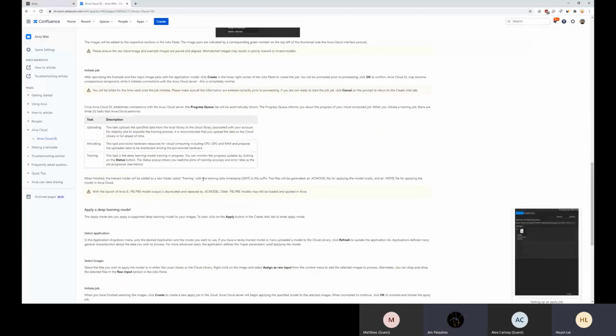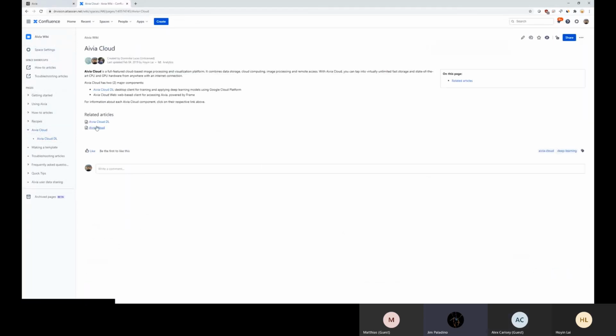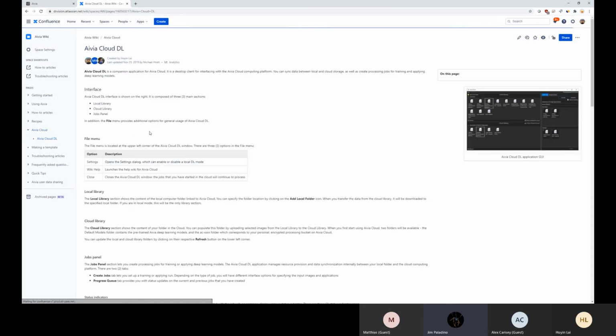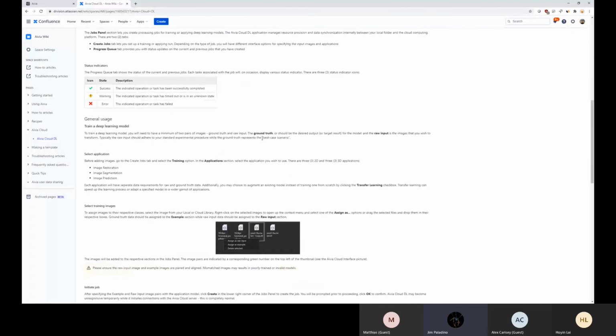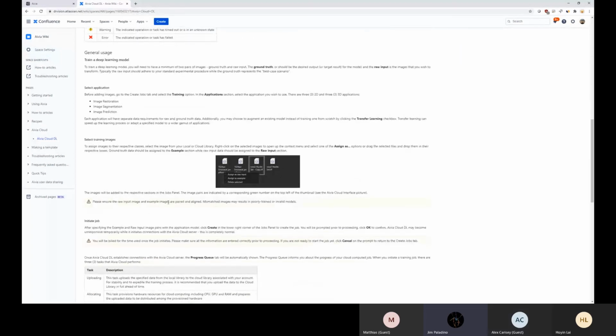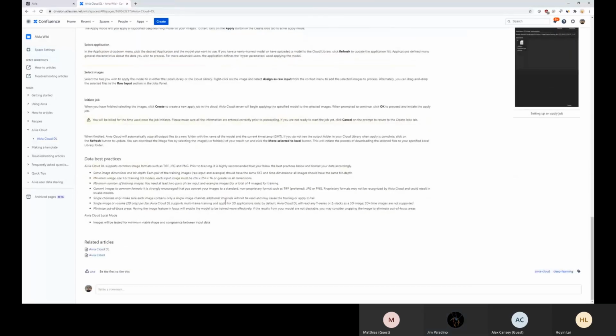And not just the dimensions of the image or the bit depth, but if you're working with something like restoration, you should try to have as best a pixel-to-pixel registration as possible. In other words, if you have a ground truth image, a high signal to noise versus a low signal to noise, when you're creating your initial model, those two should match up as much as possible. Yeah, okay, that's good to know, because the STED gives us a very different signal to noise ratio from the confocal. Right. So we'll be careful about this.